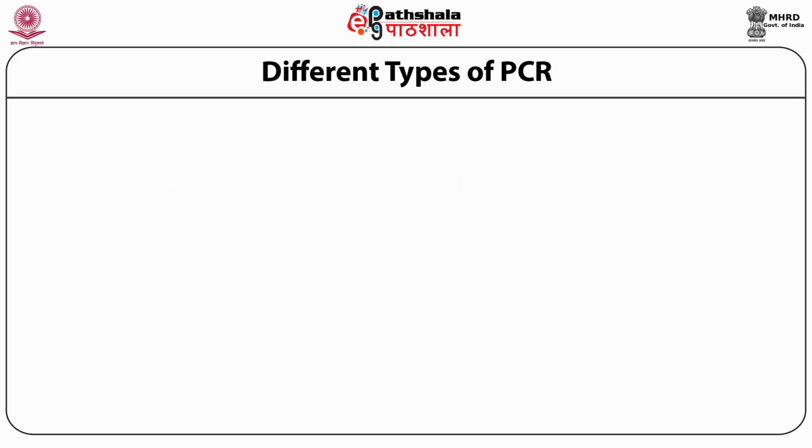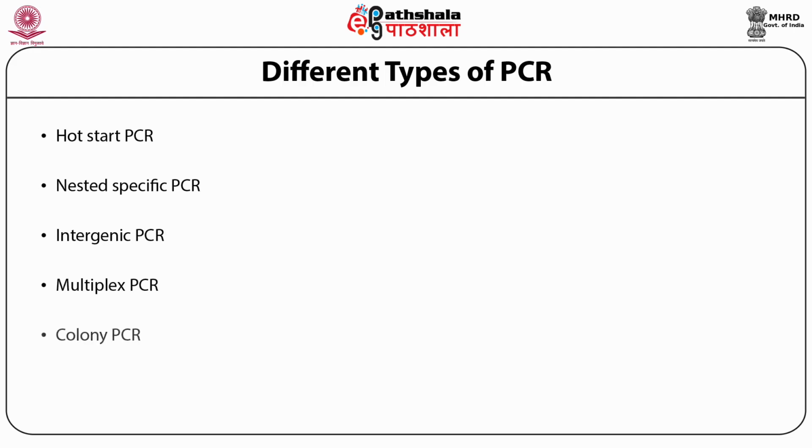So now I would explain the different types of PCR. I have already explained to you about hot start PCR, nested PCR, intergenic PCR, multiplex PCR, colony PCR, and reverse transcription PCR.